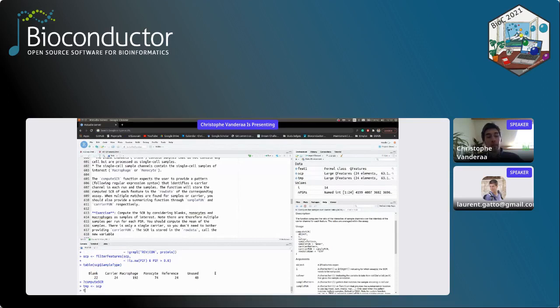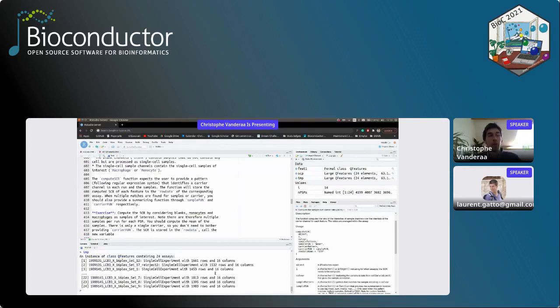And so like this, you saved your data in a temporary variable. Now if you mess up your data set, all you have to do is reassign SCP to this temporary variable. No, the other way around, sorry. Yeah, that might avoid some annoyance.